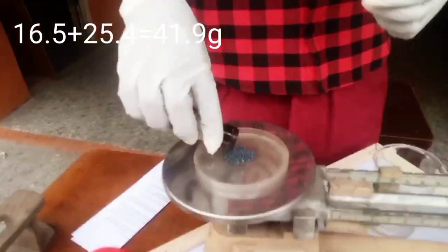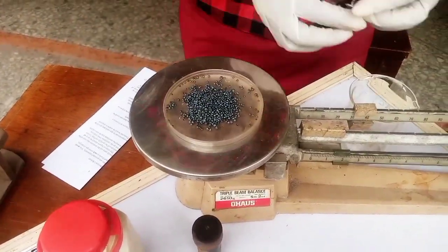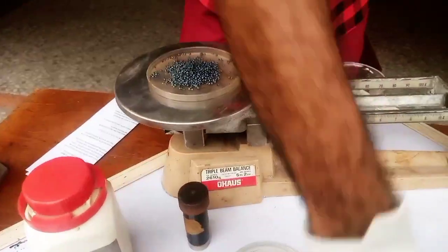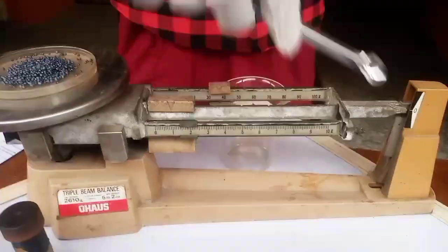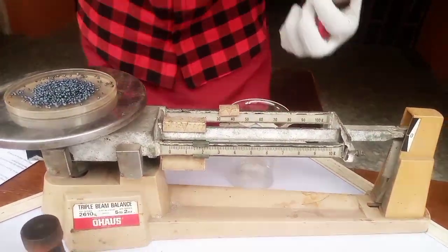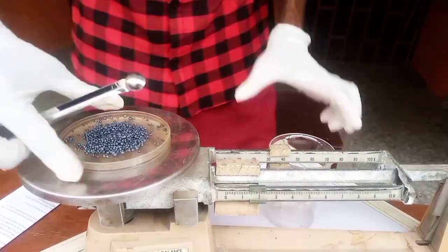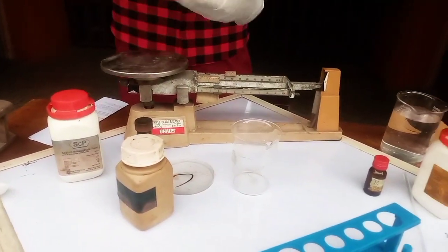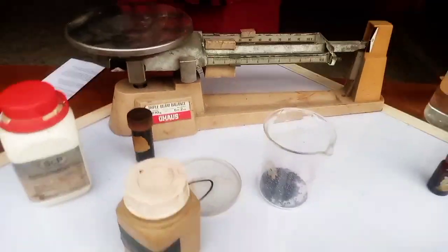I added the iodine so that the pointer of the beam balance will be at zero. I noticed that it was above the zero, that's why I reduced some portion of the iodine from it. The next thing I need to do is to take it and put it inside a beaker and cover it. And when I cover it, I need to bring up the sodium thiosulfate and also do the same thing for what I did for the iodine.